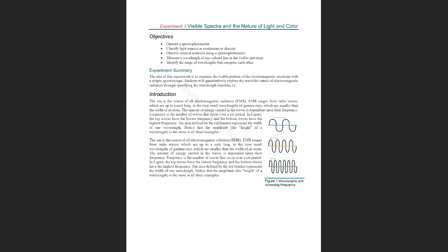Number three, to identify various wavelengths, lambda, from a fluorescent lamp spectrum, and recognize the energy and color of a short and long wavelength.